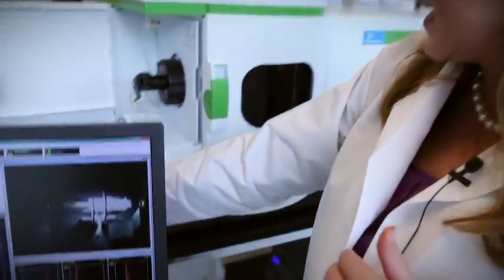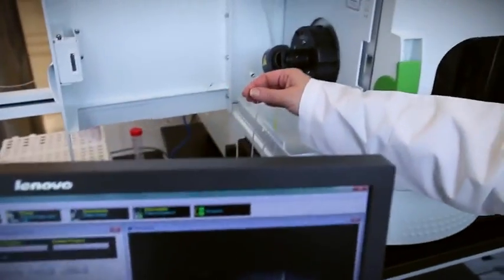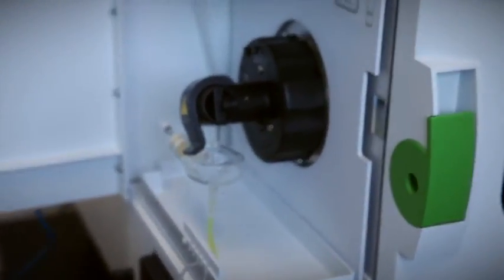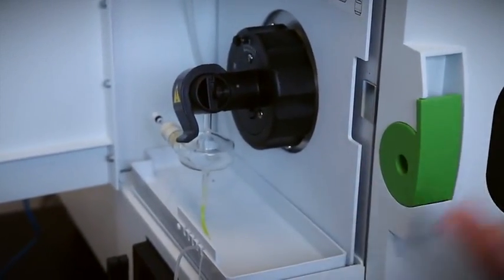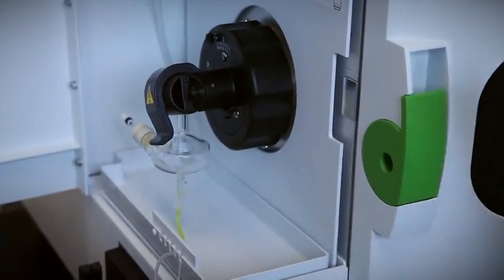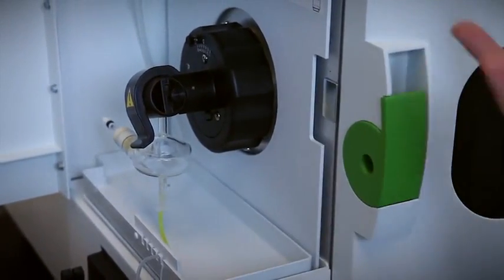So what you see here is actually starting off, you put your sample, there's actually a little plastic tube that sucks in the sample continuously. And this is a nebulizer that goes from the liquid state to a gas state. Because the only way you can actually see an atom from atomic emission is if you turn it into a gas.